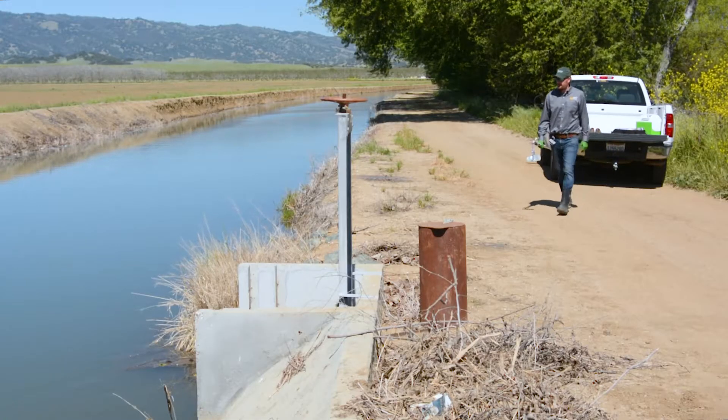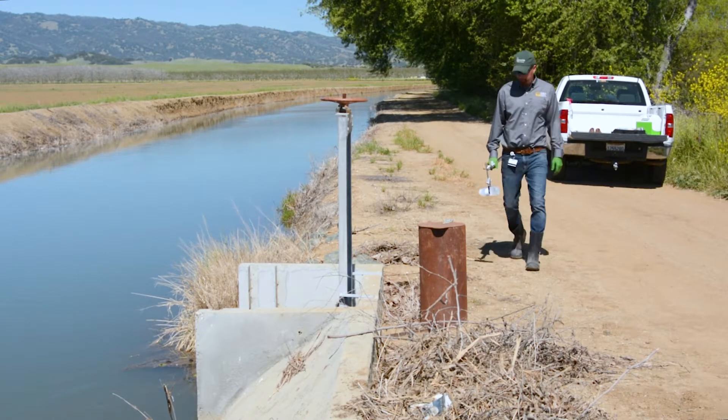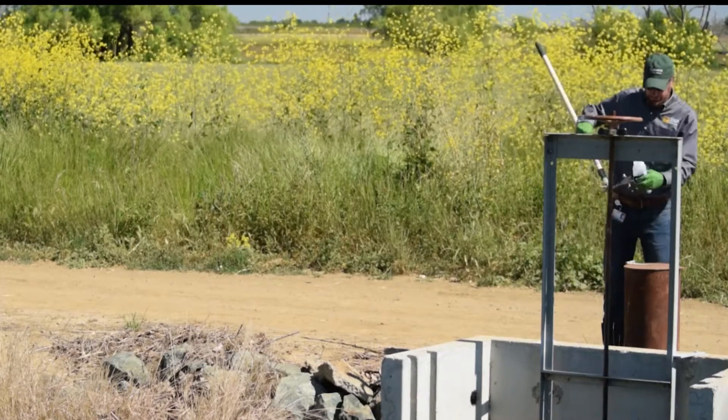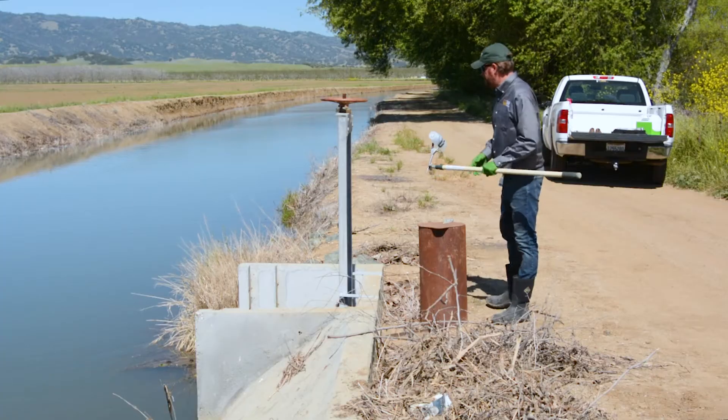Choose a safe sampling location where you won't slip. Water samples should be collected as close to the outflow location as possible. This may be an irrigation system turnout, like the one shown here.